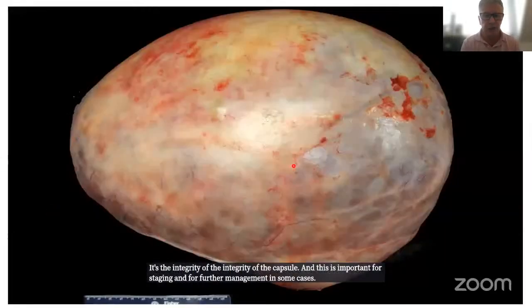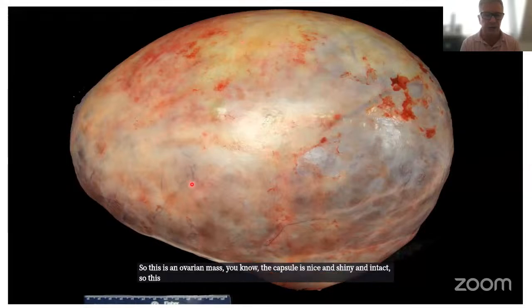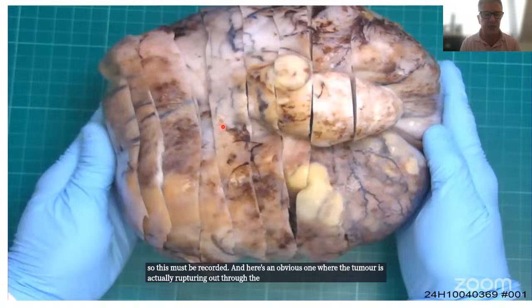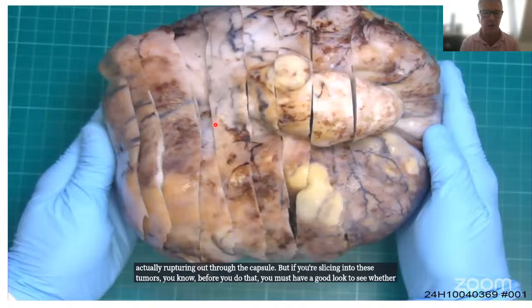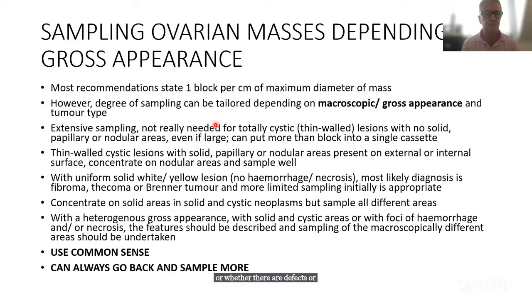So this is an ovarian mass. The capsule is nice and shiny and intact, so this must be recorded. And here's an obvious one where the tumor is actually rupturing out through the capsule. But if you're slicing into these tumors, before you do that, you must have a good look to see whether the capsule is intact or whether there are defects or tumor deposits.